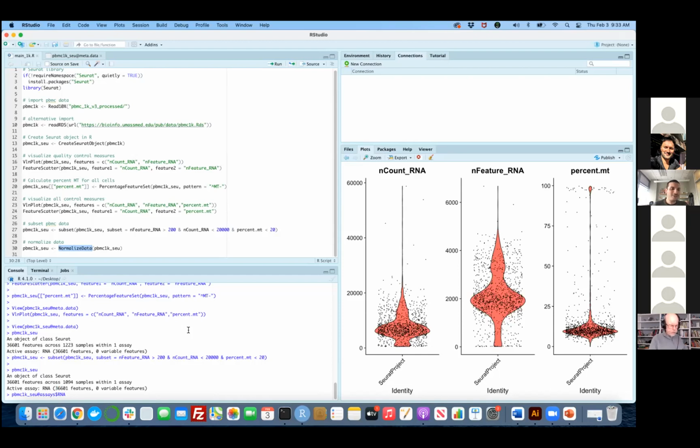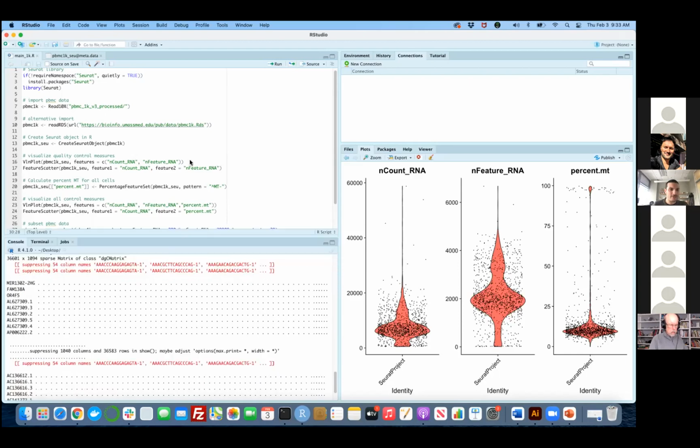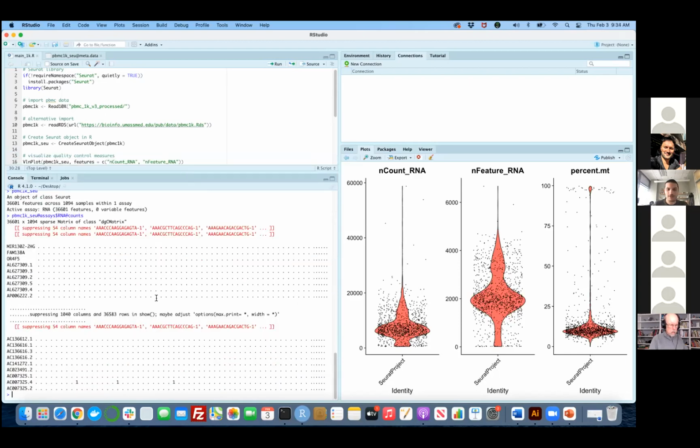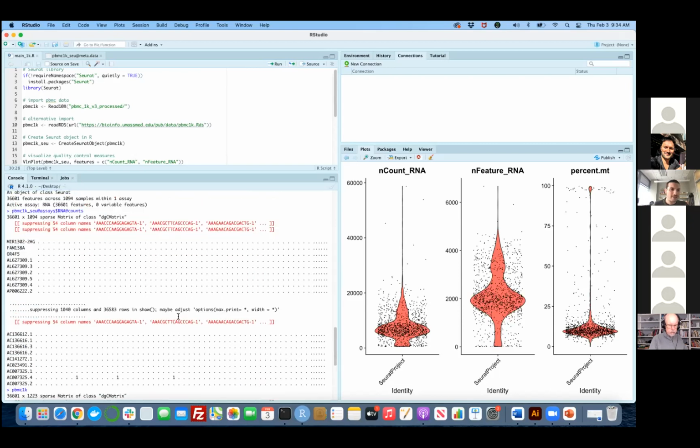Now we're going to click on @ again. As you can see, the Seurat object has a lot of levels. You just click on counts to see the raw counts that we imported in the first place. It's the same matrix we worked on in the beginning, right? So it's the same as this object. Basically, we are taking the raw counts everywhere we go.